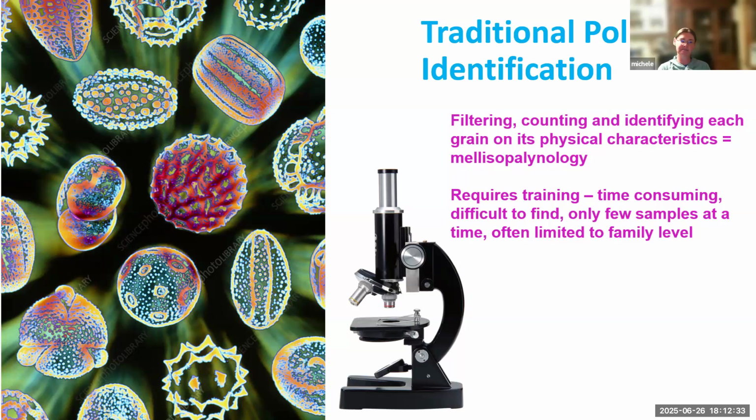It also requires many, many hours of training to get somebody who's accurate. It's extremely time consuming. You can only look at one sample for so long. You only have so long to process each sample. And how many could you realistically get done in a day? If you're somebody who's very experienced, you might be very quick, but if you're training someone, that's going to take time for them to achieve that level of skill and look at enough samples to become a flat out expert that quickly.